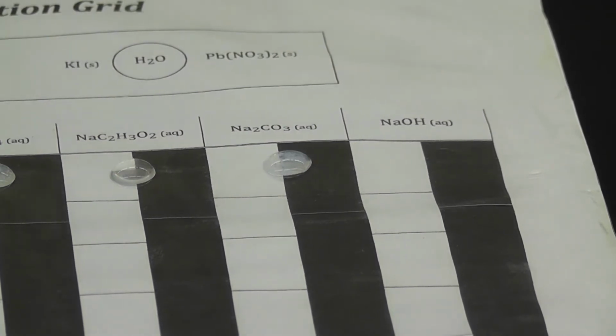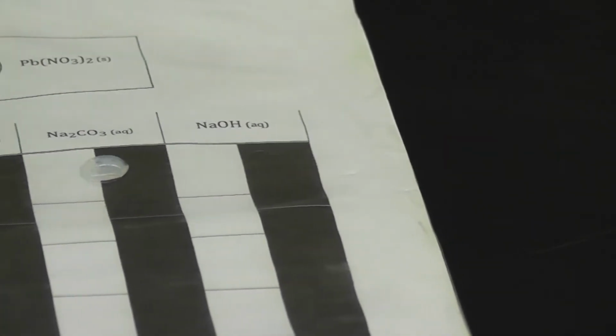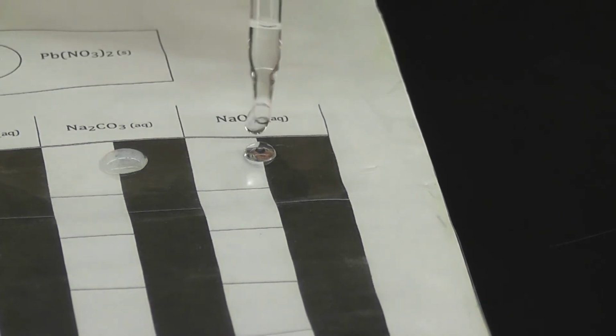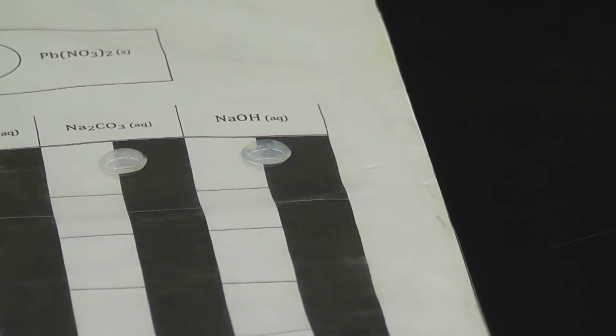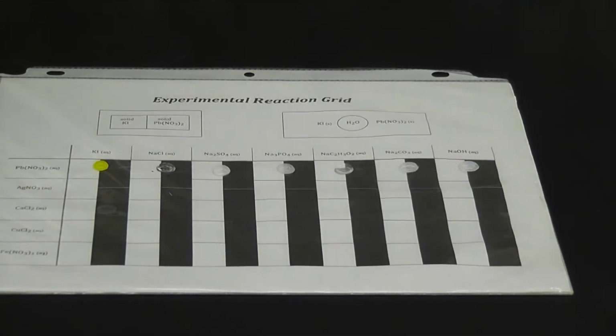Okay, last one with the lead-2 nitrate. Okay, so 1 drop of lead-2 nitrate. And then lastly with the sodium hydroxide. I can get this open. Okay, 1 drop of sodium hydroxide. All right. So that is the first row. All right, so let's go this second line.